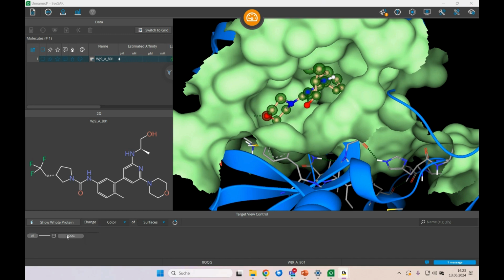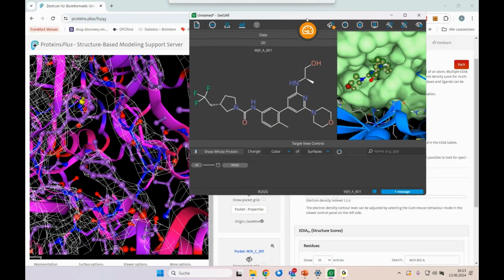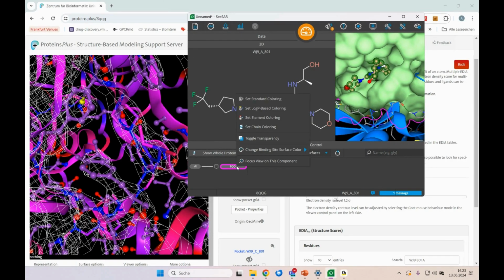Right mouse click on the AQ. Yeah, there. No, it's not working. But wait, I had the same problem. It is actually a go-to thing. Don't ask me why. It overlays.